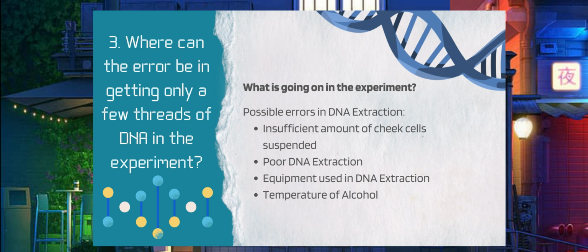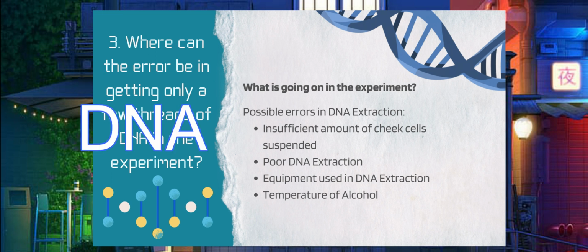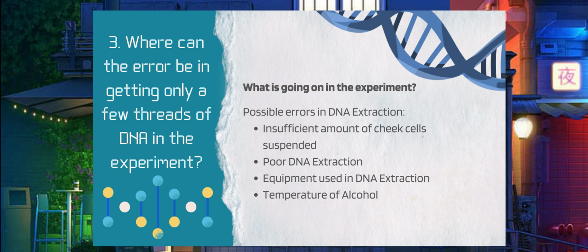But nonetheless, DNA analysis has numerous applications. It can be used to match crime scene samples, screen for genetic illnesses, or discover new species, for example. It is vital to remember that the extraction of DNA from the sample to be investigated is the first and most important step in DNA analysis. Basically, that's our observation.